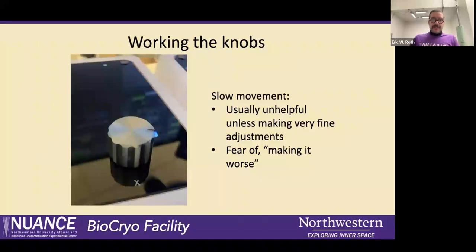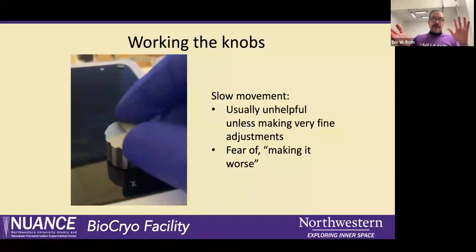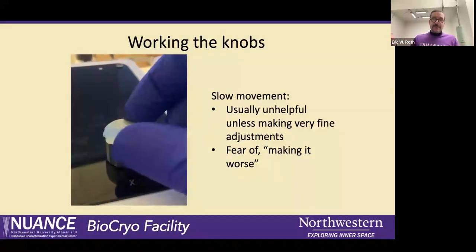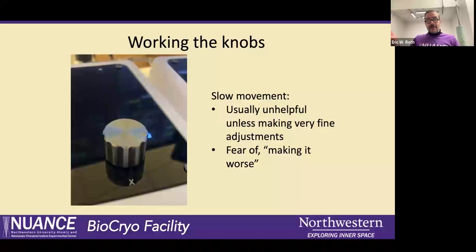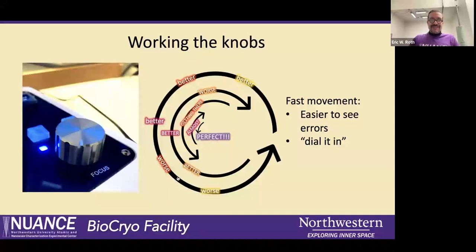All right, one thing, and I hope this doesn't sound too patronizing or mansplaining, but one thing I see a lot is when people are using the knobs, they're moving them just the tiniest bit at a time. And when you're doing that, often you're not going to see any change in your image. People are maybe afraid to make it worse, but really, if you're not seeing any change, then you're going to chase it. You'll go try to change something else, and then you'll be chasing a problem. So don't do that.